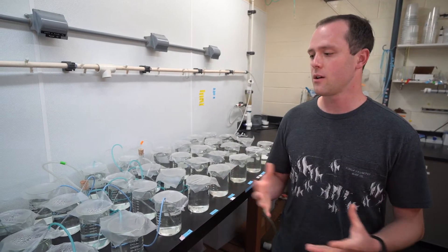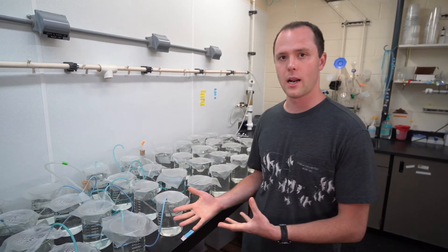After we go through those stages on a really small scale, we then often scale up to what you're looking at here, which are 1-liter beakers.